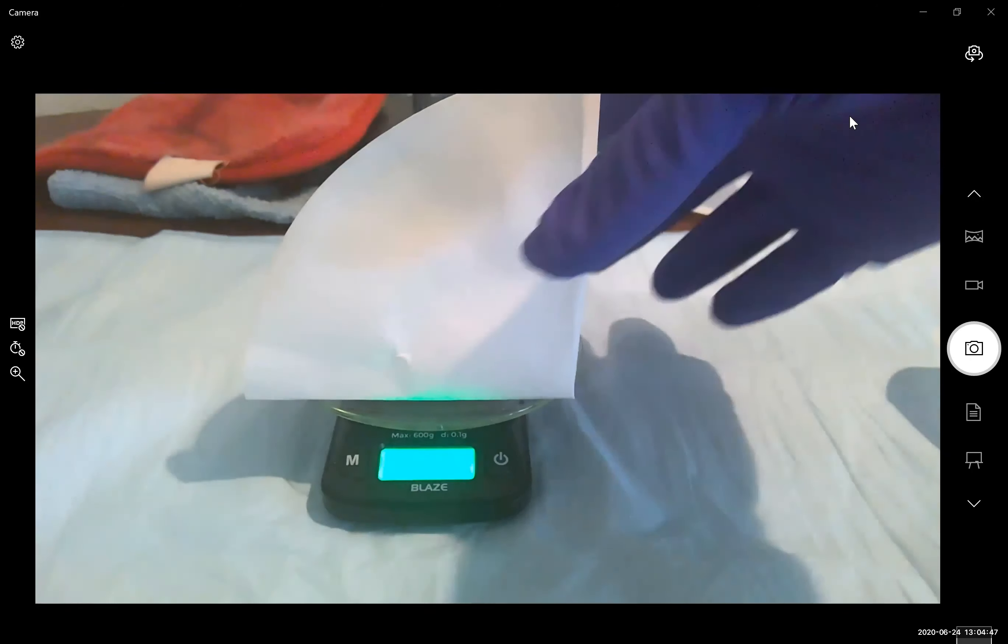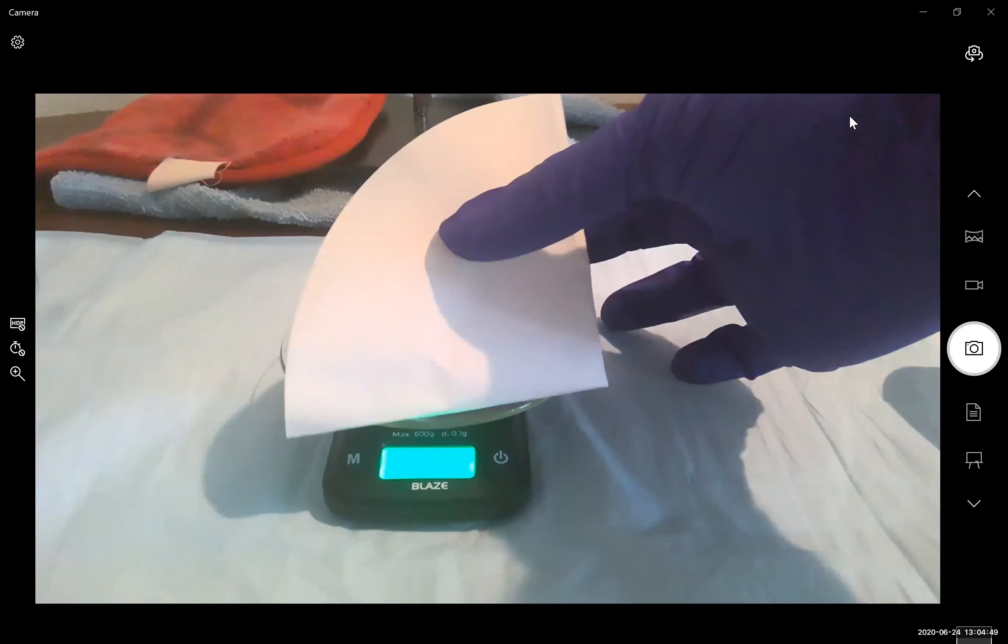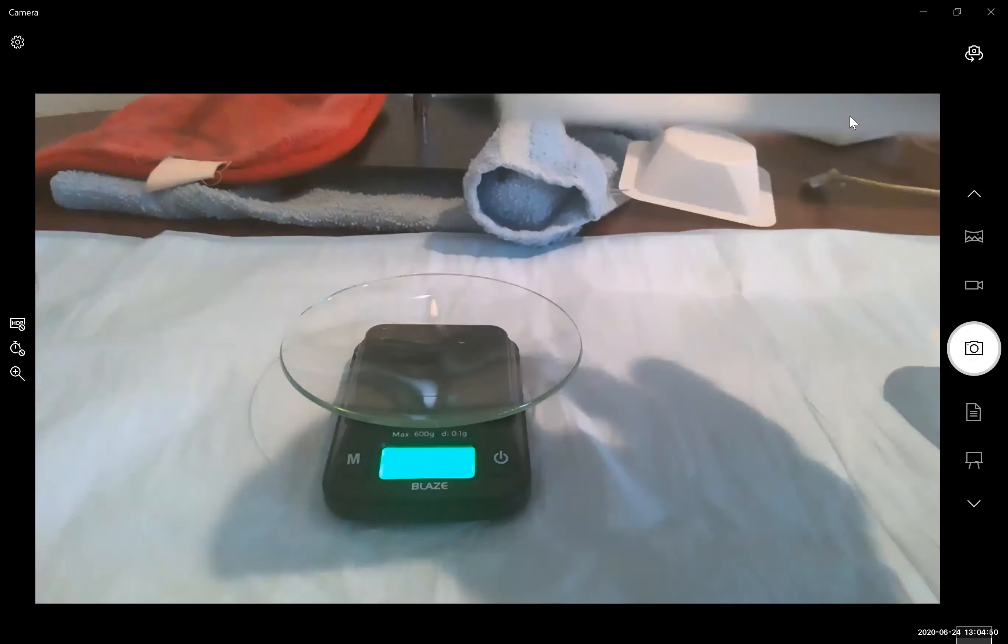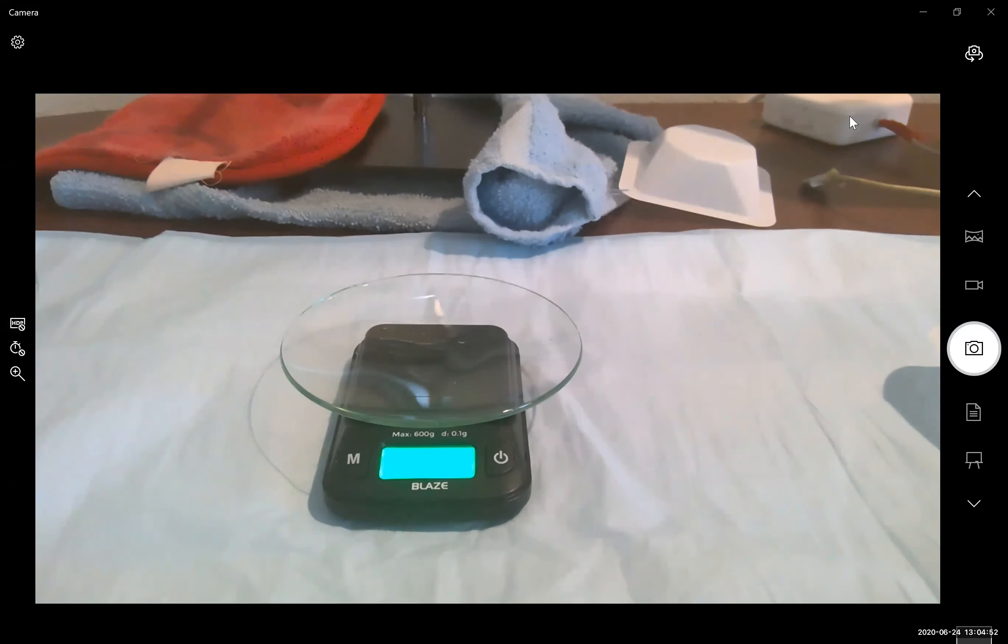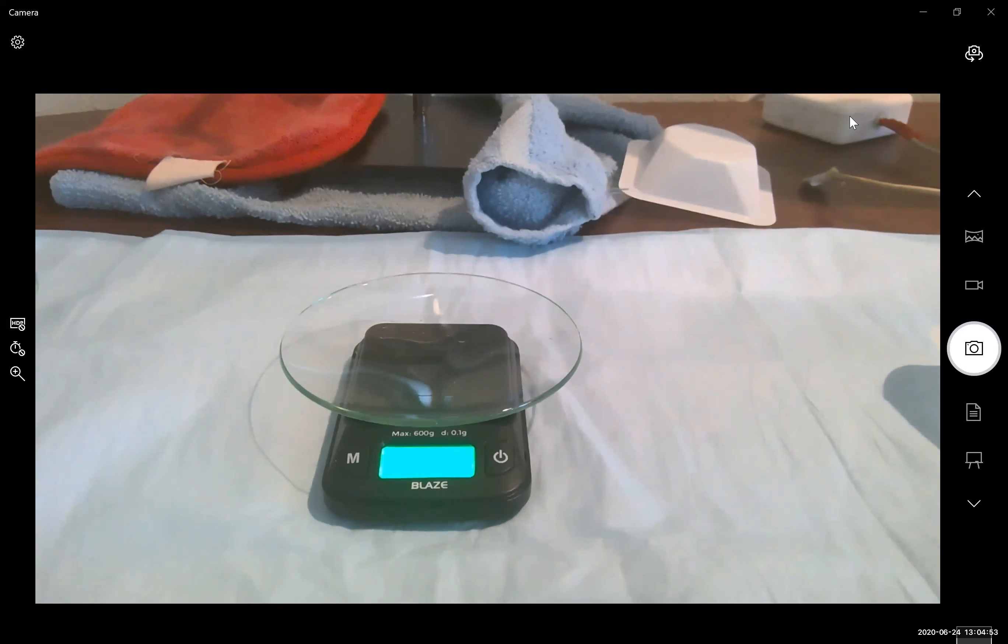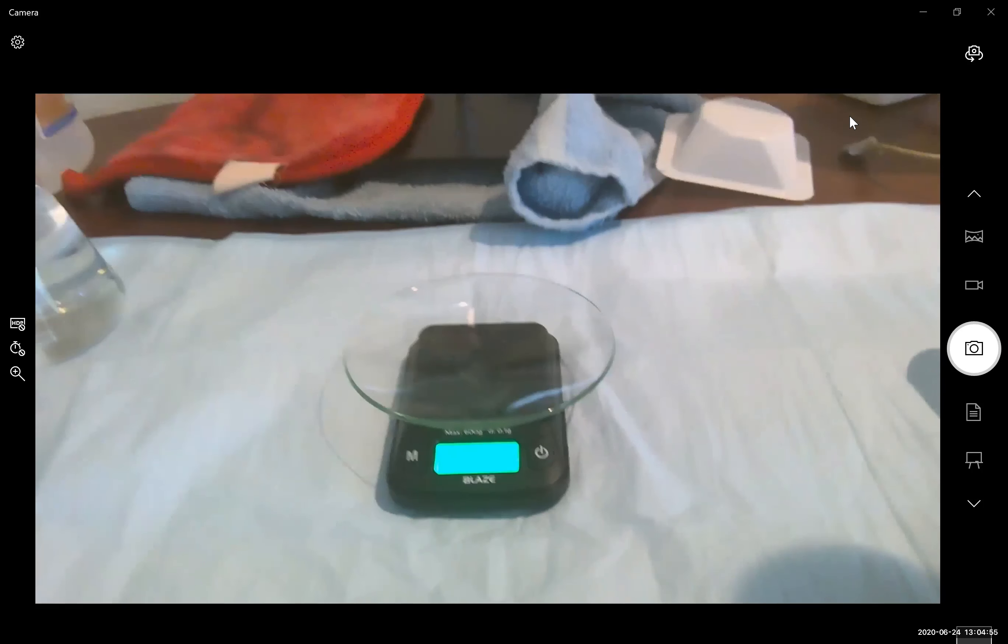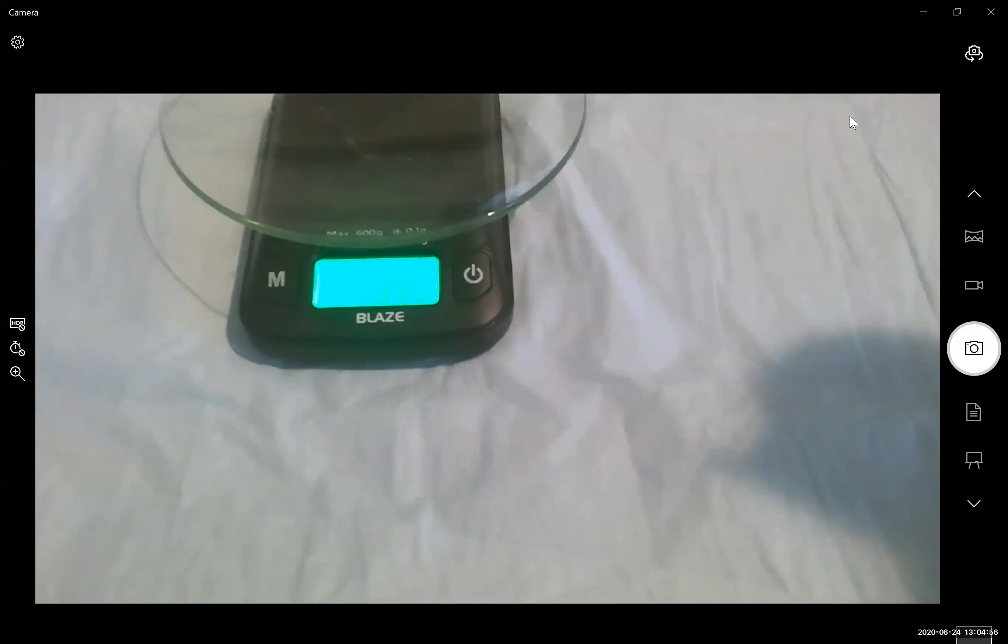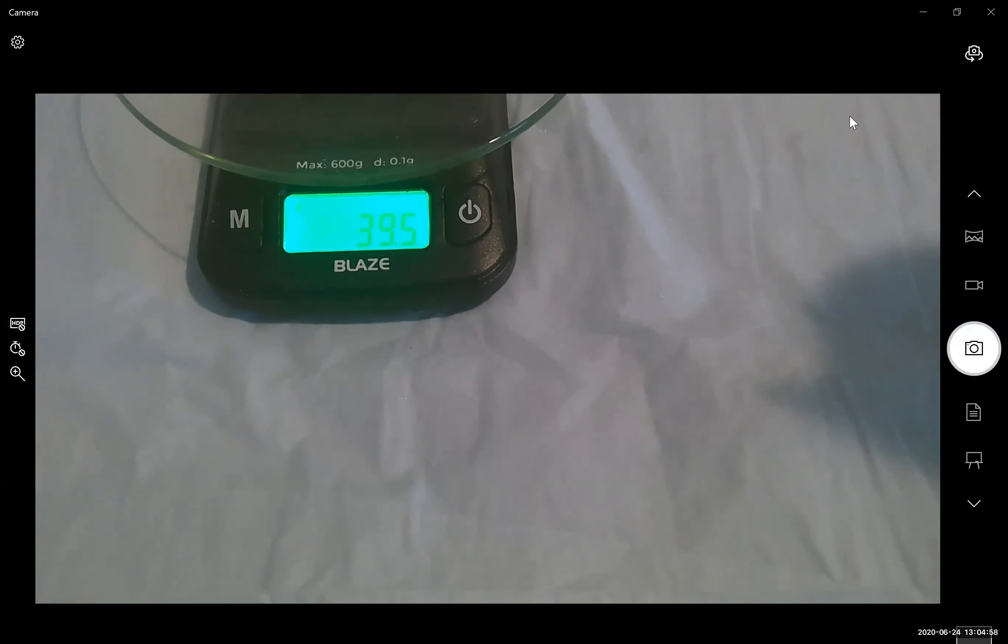Just for your reference, I'm going to take off the weigh paper. And you can record if you haven't, or if you missed it last time. Here is the mass of our watch glass alone.